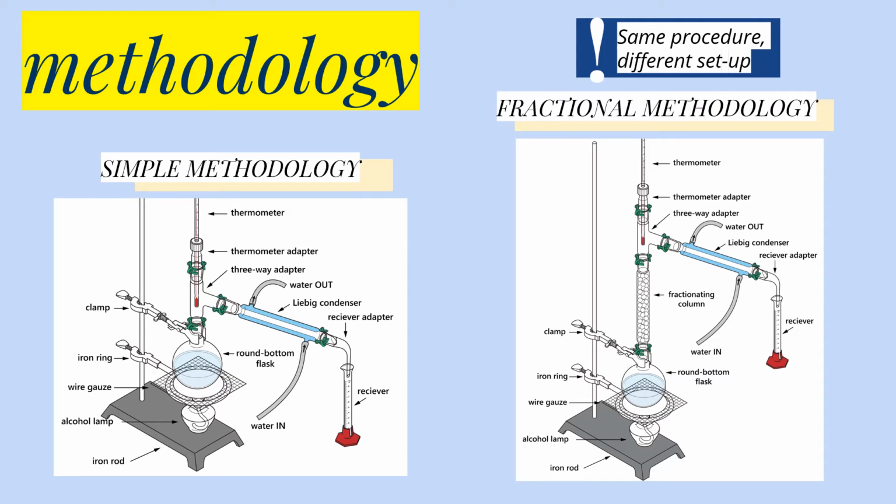In this experiment, our objective was to separate the components of a mixture using the two common distillation operations, namely simple and fractional distillation. Their difference is mainly in how the setup was assembled.